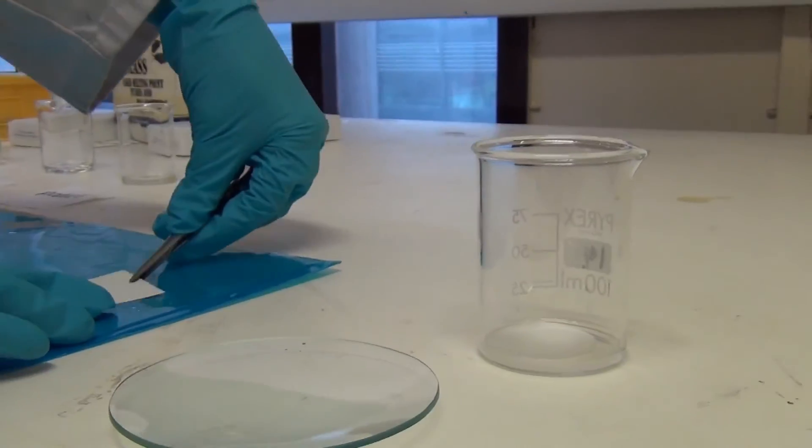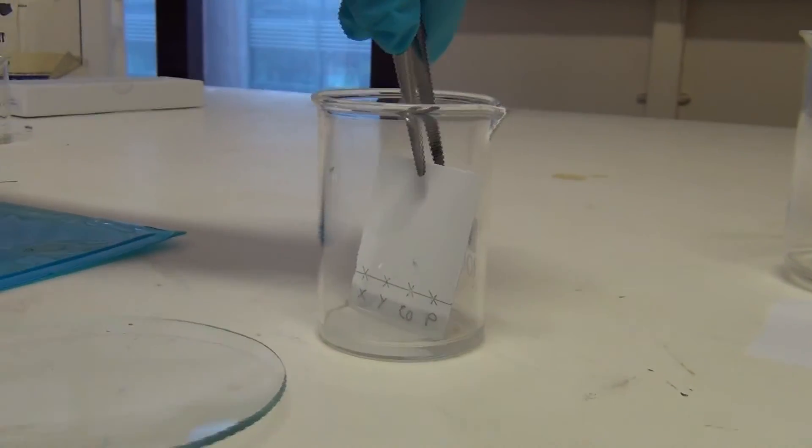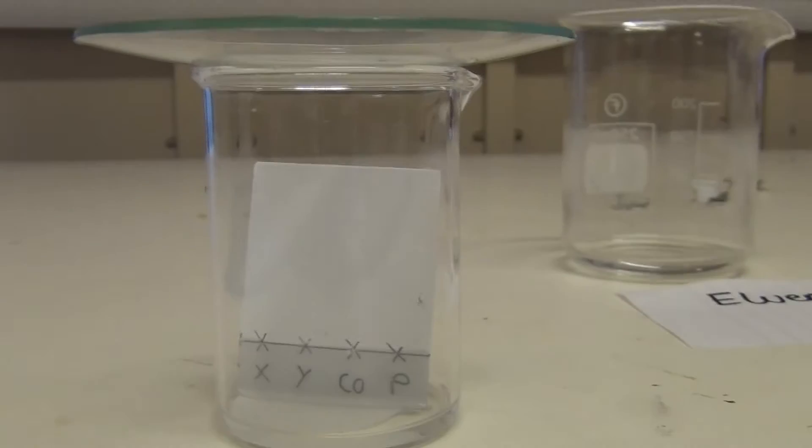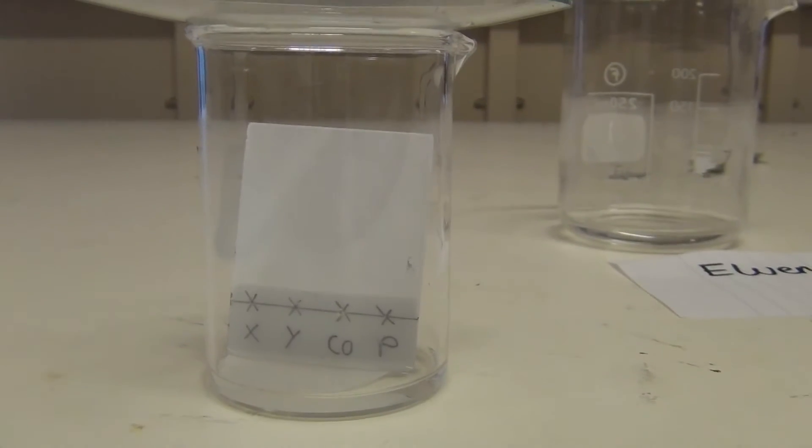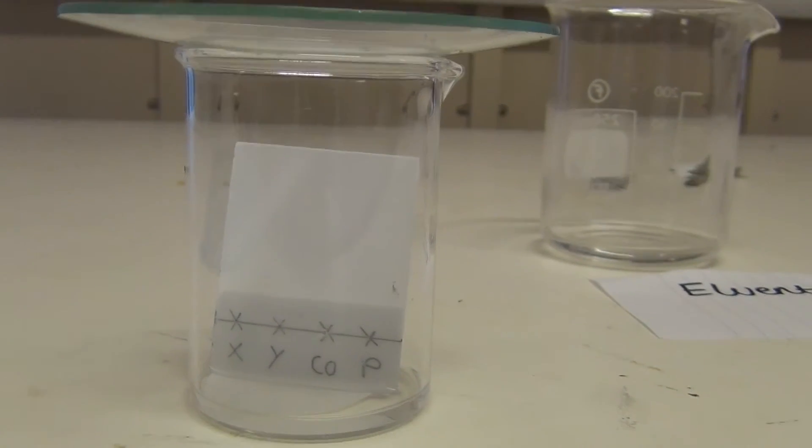Once the chamber is saturated with eluent, remove the lid and using tweezers carefully place the TLC plate onto the bottom of the chamber, and immediately place the lid back onto the top.